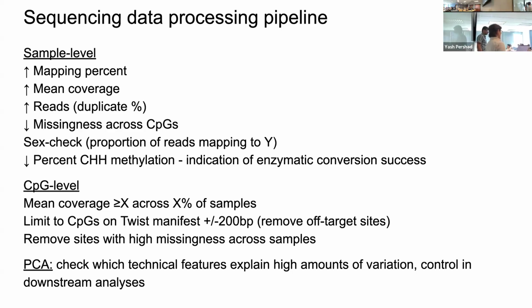Most of this will not be a problem for most experiments that you do. If you're really working with low quality DNA, it might be something to pay extra attention to, or really, really small input volumes. And then I also would check the missingness, so just make sure that sample is very complete. Maybe a CX file didn't convert or something, or it just missed it. We were missing a chunk of chromosome 1. So I just plot missingness on a per sample basis and make sure that I have a lot of data for every sample.